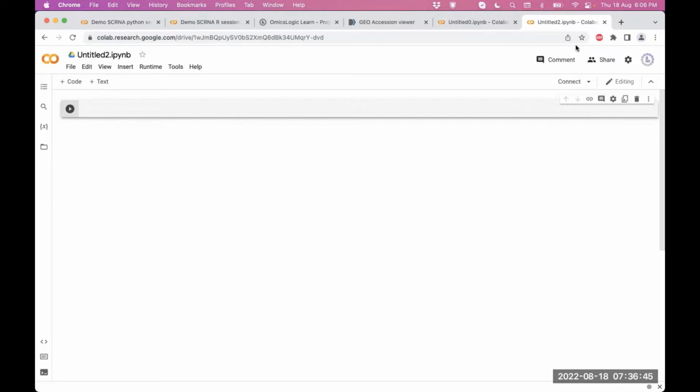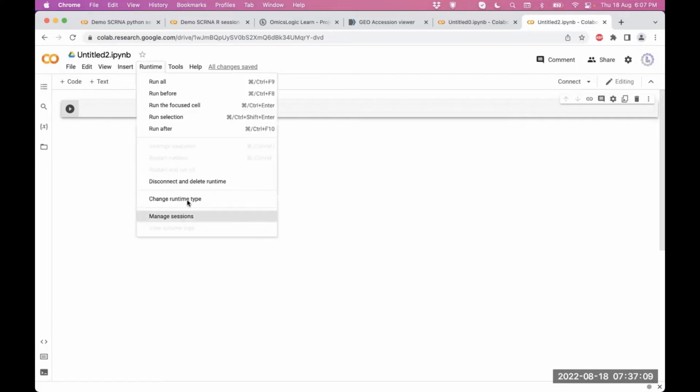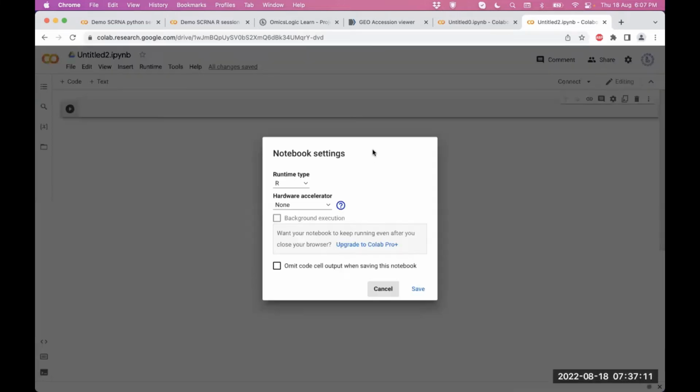So how are we going to run this while we are exploring some of the codes? In this environment, I started it by typing colab.to/R, so I know that it is an R environment. But if you're unsure, or land up in someone else's Colab, you can find out by opening Runtime again and using the option Change runtime type.